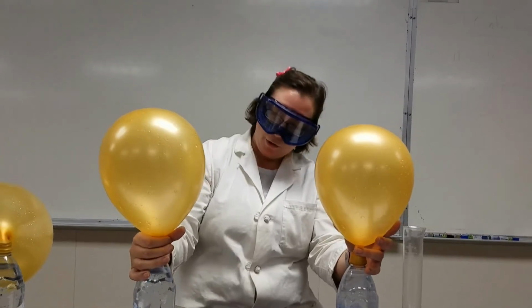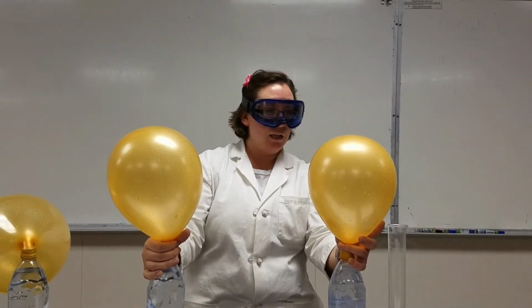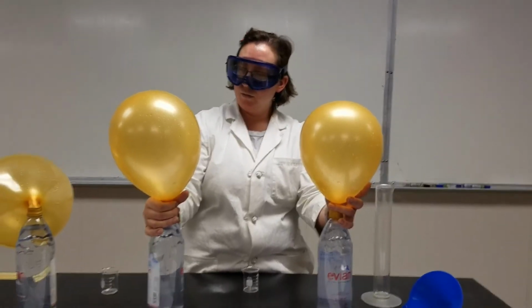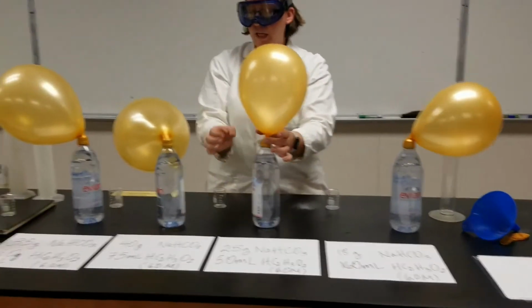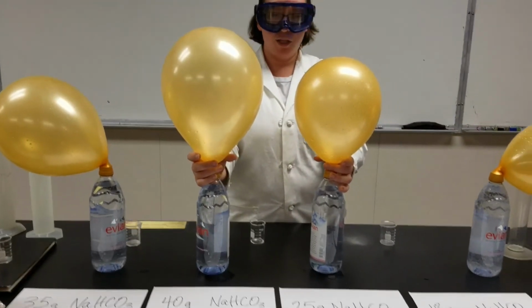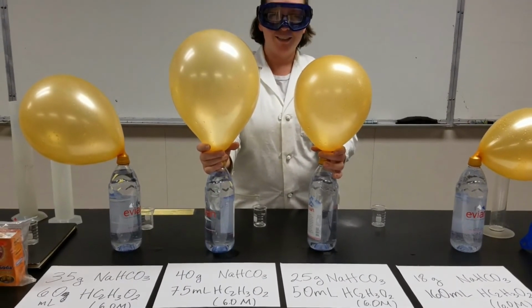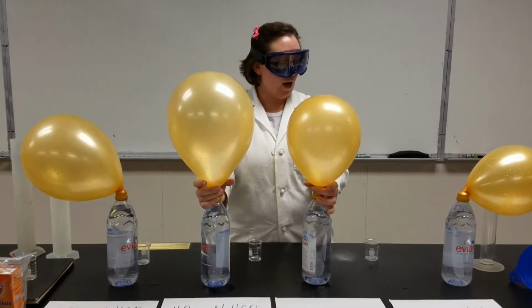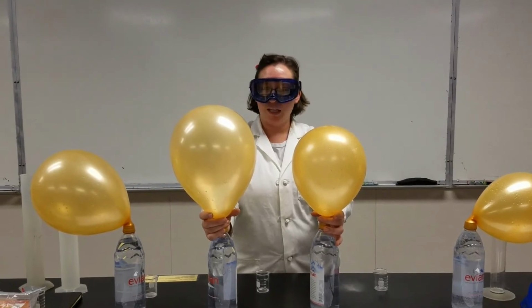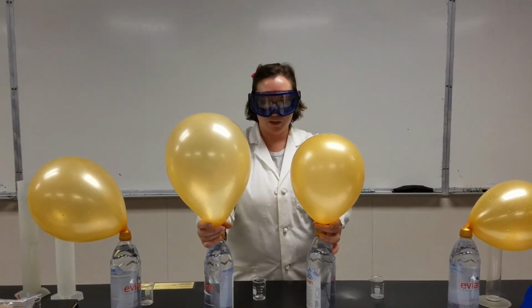I would go ahead and conclude, at least from my eyes, reaction D is the smallest, and reaction B was the largest. And it's a good thing that we have stoichiometry to explain why that is, and to make a prediction to be sure that we don't exceed the capacity of our balloons.